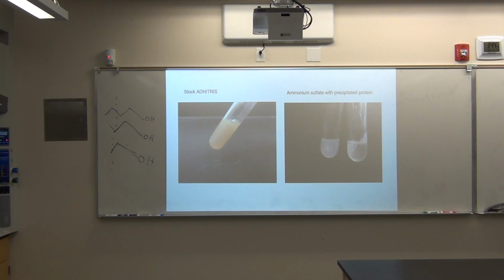It was very clear too, because when we used the pure ADH and we salted it out, it was opaque. It looked like there was a lot of colloids in it. I don't know, it just wasn't as good. So we did the 1 to 3, and then we added the salt, and the proteins would literally form. We would add the salt dropwise, so you could see the salt hit the surface of the water and split up, and you would see proteins forming as it did that.